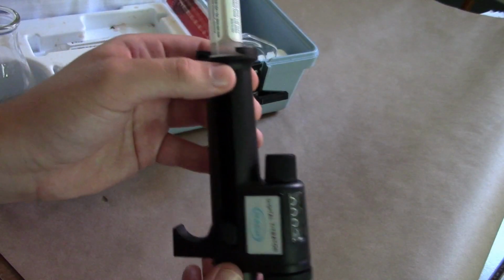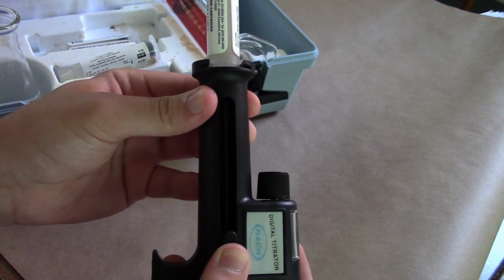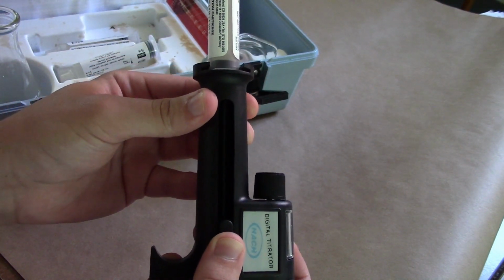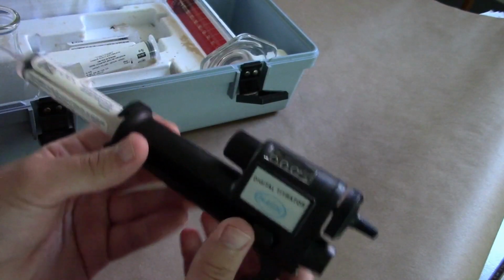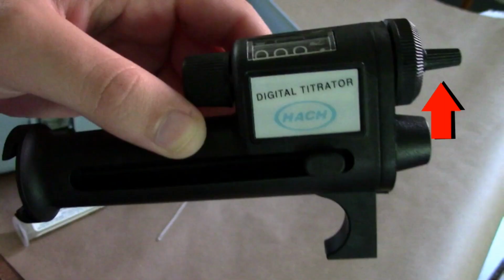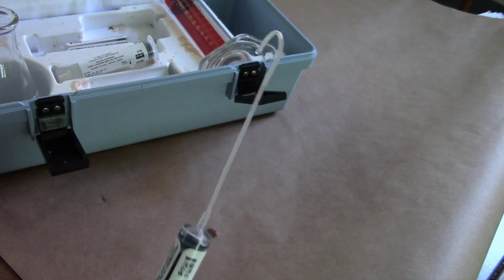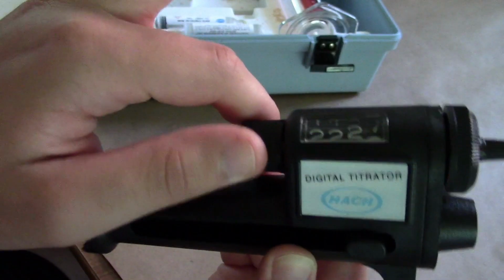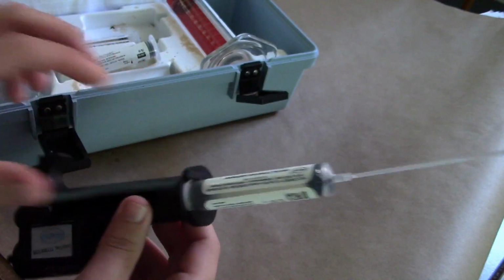Now I'm going to use the plunger. So I'll press in this button and push it until the end of the plunger reaches the top of the cartridge. Then I'll turn this knob until I see a drop of acid released from the thin hook dispenser tube. Now I simply re-zero it. So now our titrator is all set up.